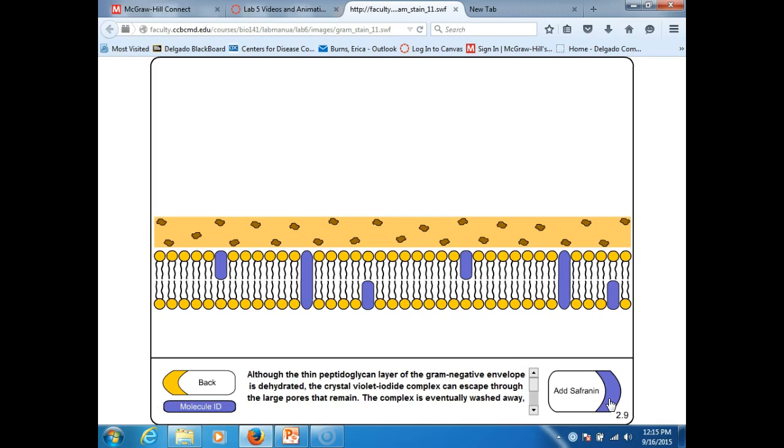The outer membrane, because membranes, lipids, can be dissolved by ethanol or things like acetone. We don't use acetone though. It's damaging to mucous membranes. It's yucky stuff. Alcohol works great as a decolorizer though. It'll even remove permanent marker unless the permanent marker says alcohol resistant. So permanent isn't really permanent. It just depends on what it's on though. Okay? So the crystal violet iodine gets washed out.